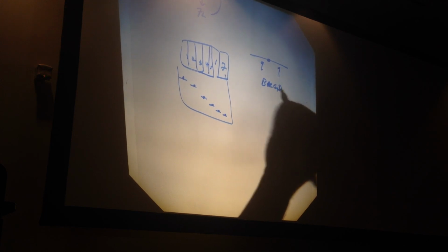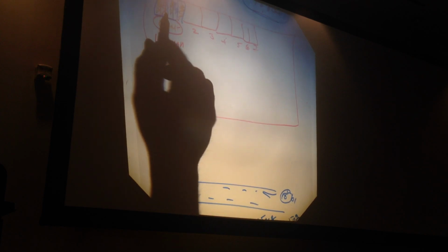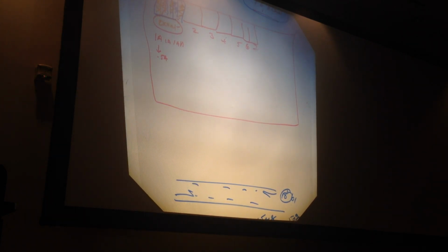Each one of these chips actually has a background detector oligo for it. This is a very sophisticated chip. Not only do you microarray and check each 18 base pairs, which overlap, but now you actually check the likelihood that it is noise by using a point mutation in the middle of the oligo.